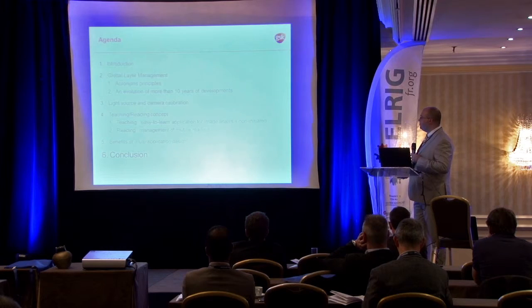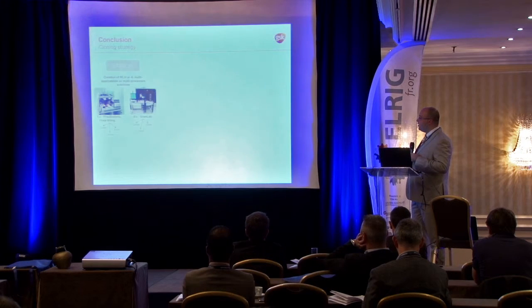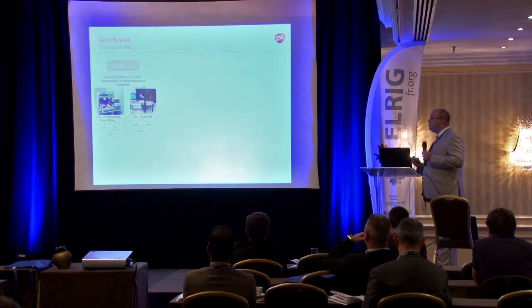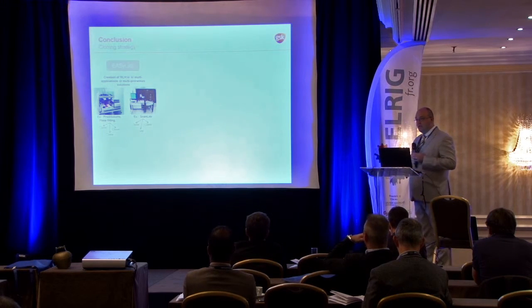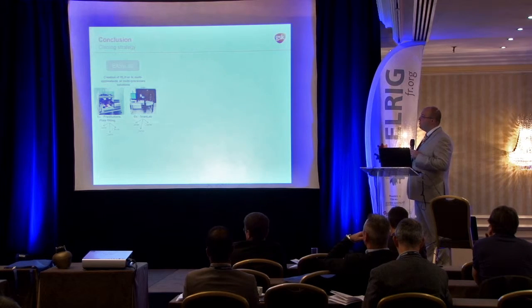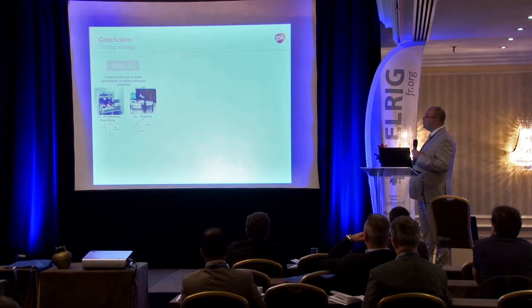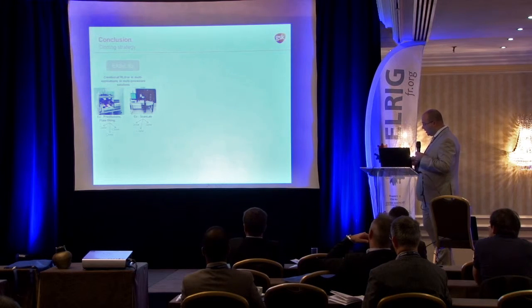So as a conclusion, this design in fact allowed us to set in place what we call the cloning strategy. It means that because you have a multi-application system, you can clone it exactly. It's always the same system, even if you have different analyses on the system. So we can clone the system. We can do it for image analysis, but why not also for liquid handling?